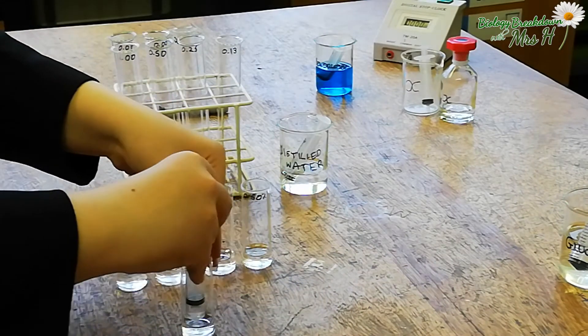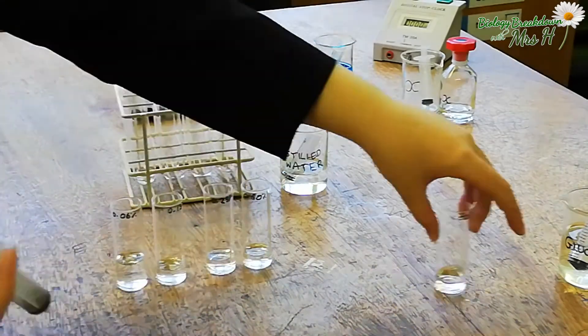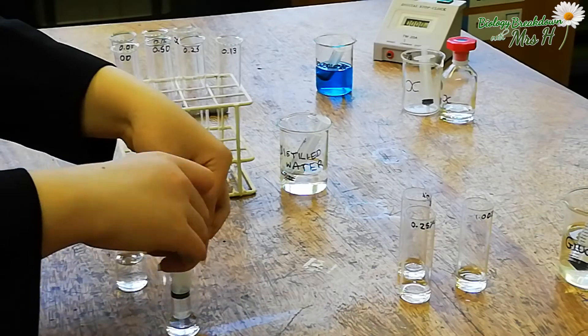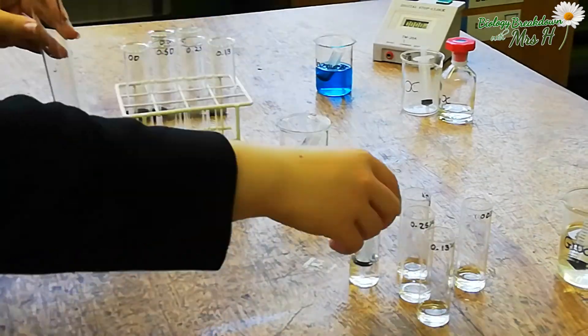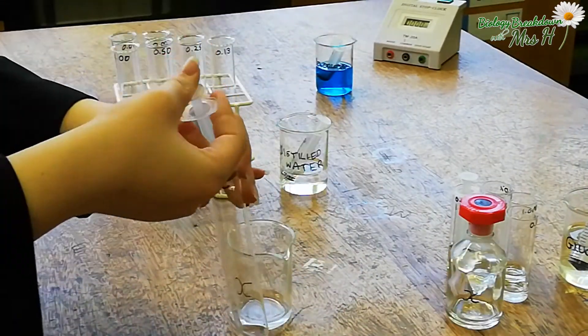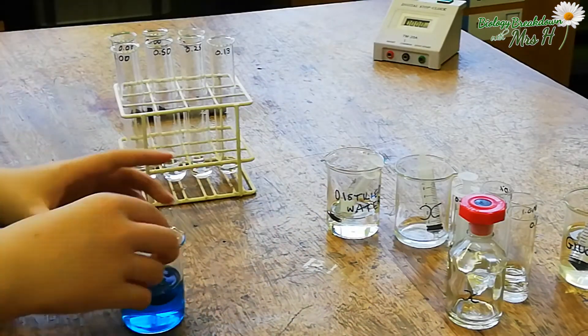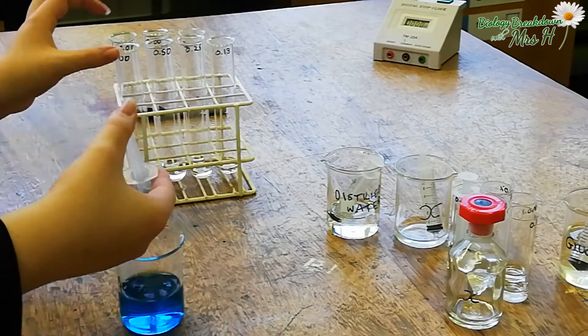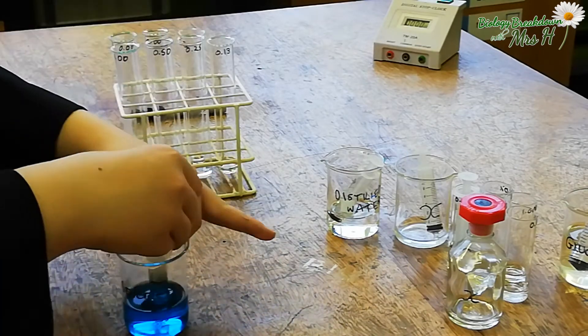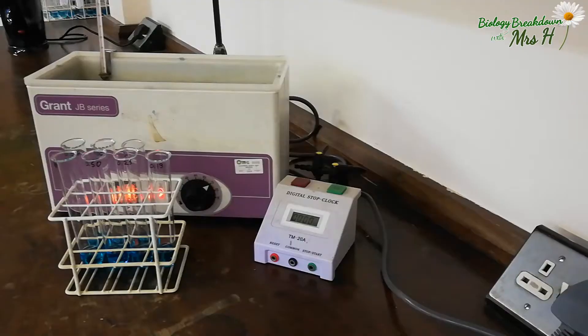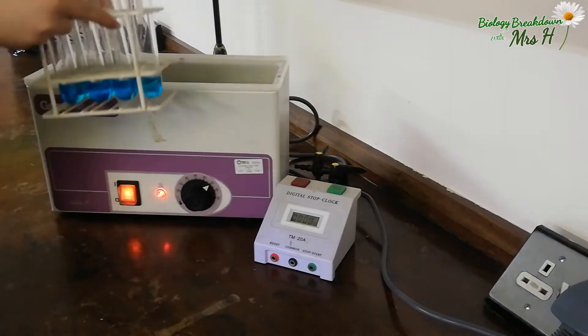Add 2 cm³ of each concentration to the corresponding boiling tubes. You will also need to add 2 cm³ of the unknown solution and 2 cm³ of the distilled water. Then add 5 cm³ of Benedict's reagent to each tube and place in a hot water bath set around 80°C for 15 minutes.